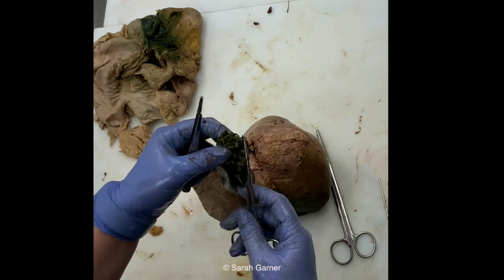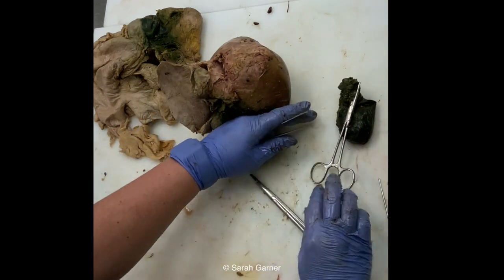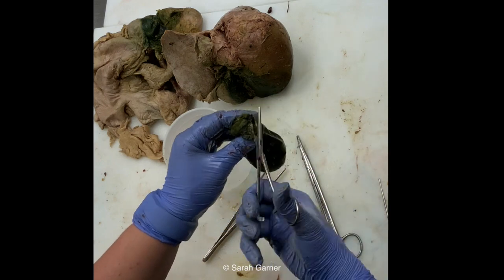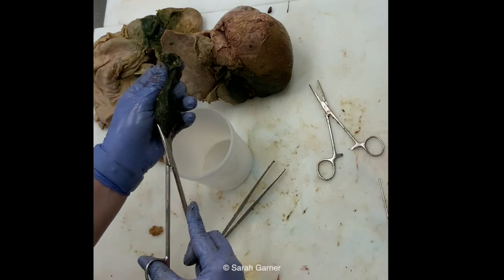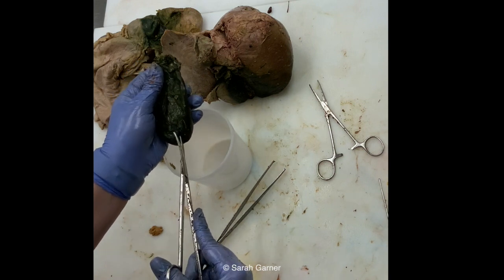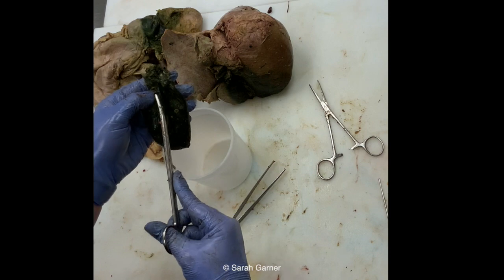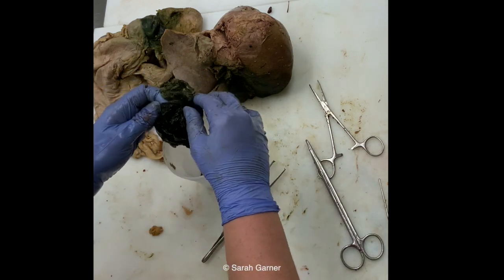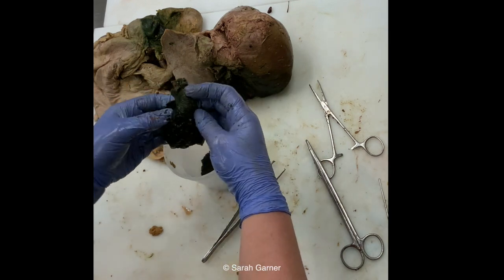You still have to open it, but again, you should be opening it over a container. So I'm going to grab a container. And you can then unclamp it because you're going to be opening it anyway, right? And kind of just let the bile out. Now, if this was fresh, this would be very less viscous. It would be kind of spilling all over the place typically.